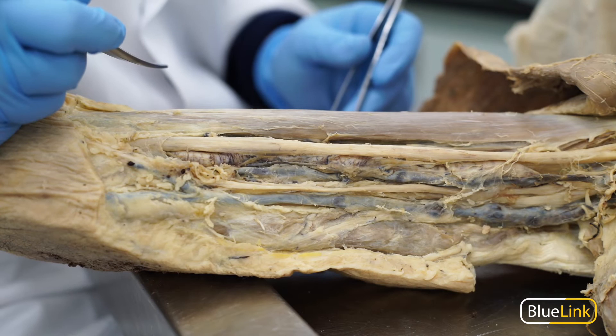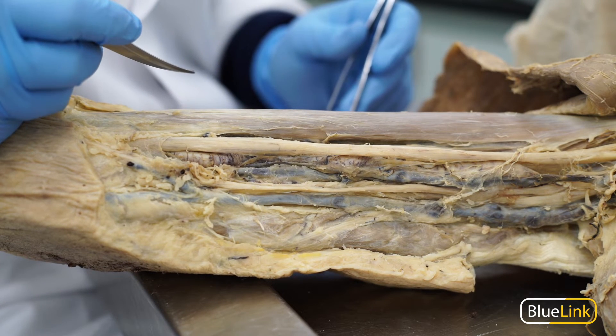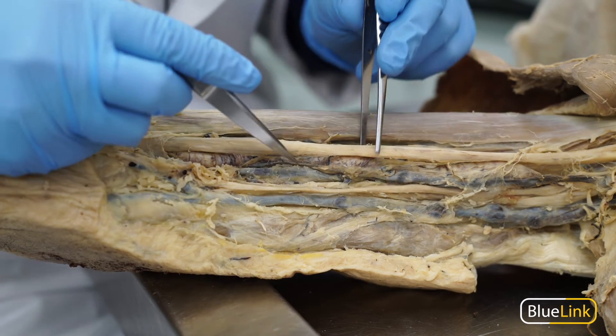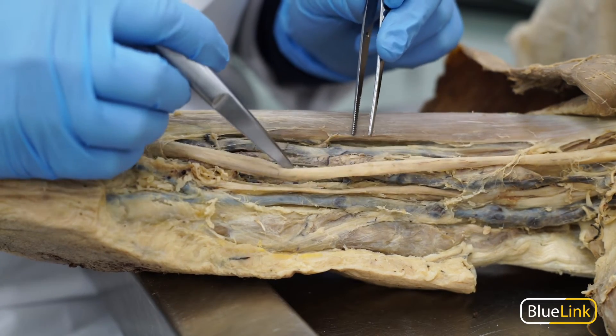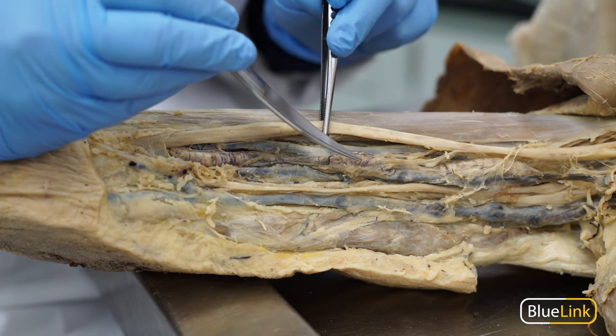Sometimes it can be tricky to differentiate between arteries, veins, and nerves in the lab, especially as the structures branch or course distally. Arteries and veins have a lumen through which blood flows, so when you touch the structure you can feel the lumen collapse beneath your fingers.